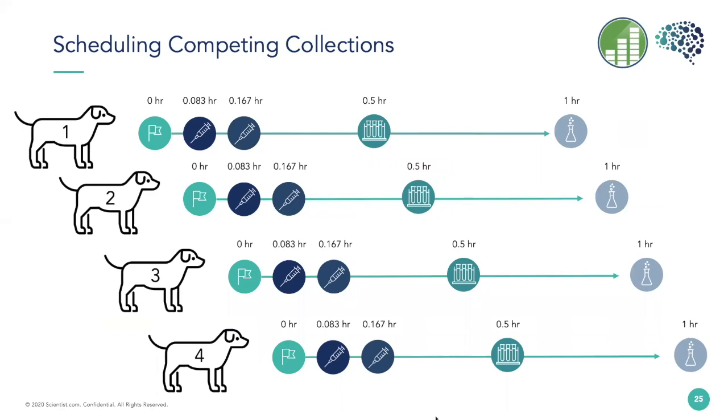And you're also literally kind of doubling or tripling the amount of people in the room. And you have collections that are actually competing with each other because there are these overlapping bloods. And then there's even the urines and the bile and things like that. And you have to determine who's doing each and which one is most important.